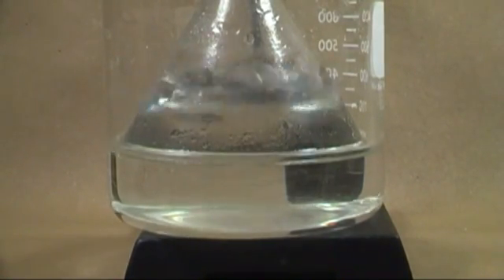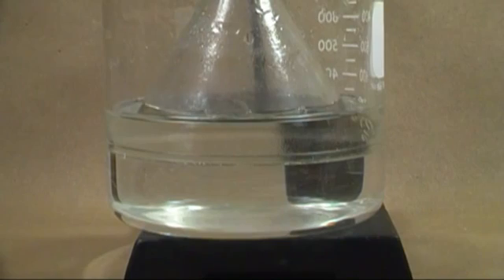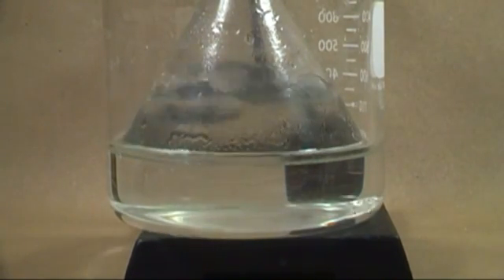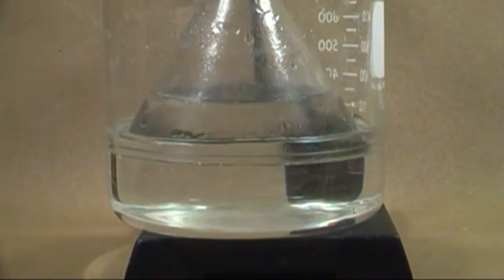This works because the volume of the funnel is greater than the volume of the water the funnel is immersed in. As you can see, there's no way for the water to get sucked back into the reaction flask with this setup.